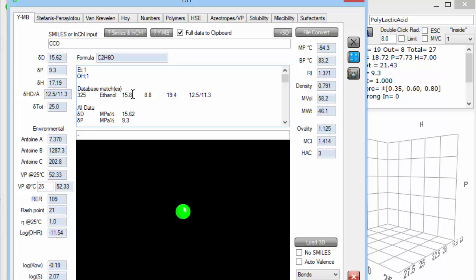You also get many other estimated parameters, melting point, boiling point, refractive index, density, molar volume, molecular weight, ovality, the Antoine constants, vapour pressures, relative evaporation rate. It's a very powerful estimation tool.